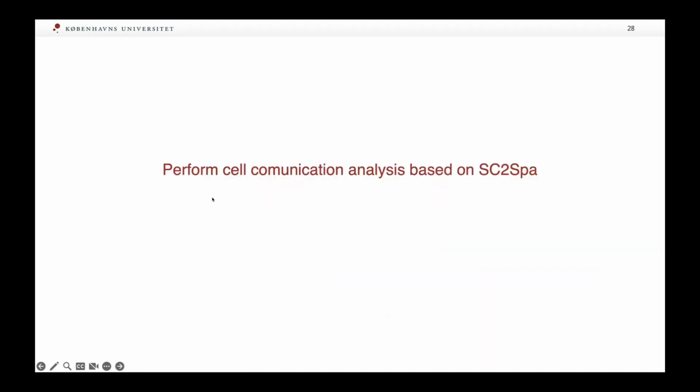And after predicting the location of single cells, we can further perform cell communication analysis based on our prediction. And you may want to know, why do we need to predict the location of single cells to do cell communication analysis? Why don't we just do cell communication analysis on ST data?